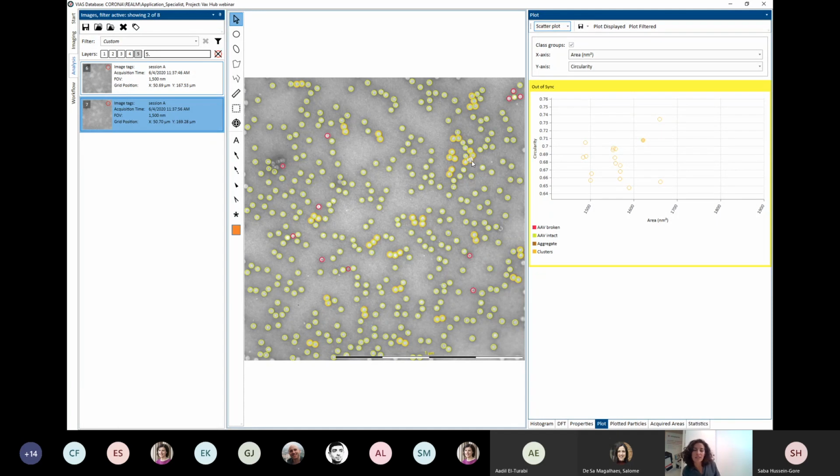And one of the things that is also important to try if you're working with new particles is to try different stains, try different things, to make sure that we are not getting any artifacts that are not attributed to your sample in particular. So sometimes some of these VLPs or lentiviral vectors don't behave the same way in lower pH, because you use that like endocytosis, so they would potentially lose their spikes. So we want to make sure that the data you are getting is as accurate as possible.